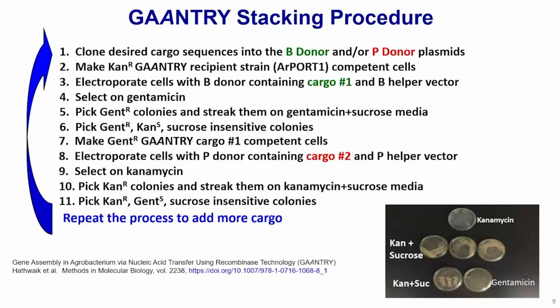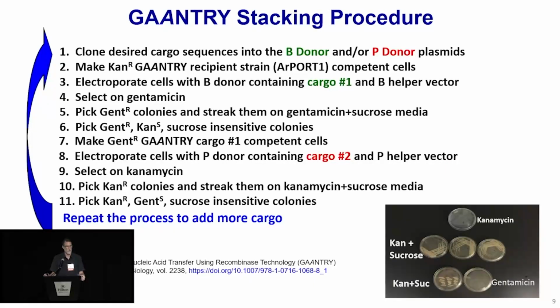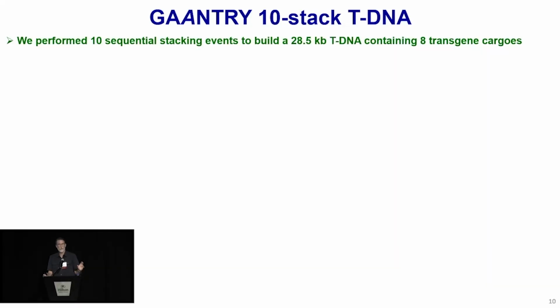So if you're interested in the details of this process, we published a book chapter in Methods in Molecular Biology, and you can look it up for all the working details of how to do this assembly. So when we initially made this system, we wanted to test how well it works, how well this works for building large stacks and for transforming plants.